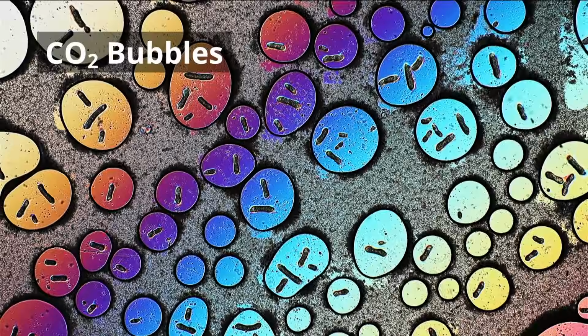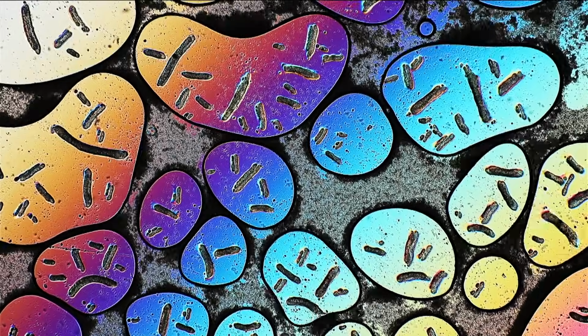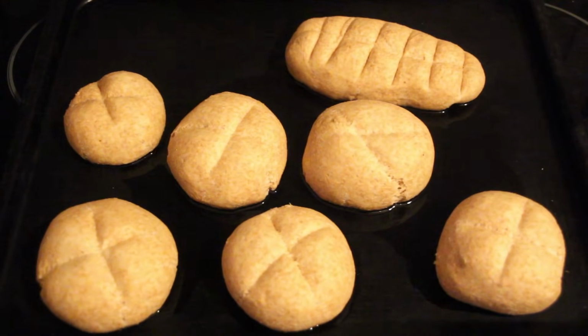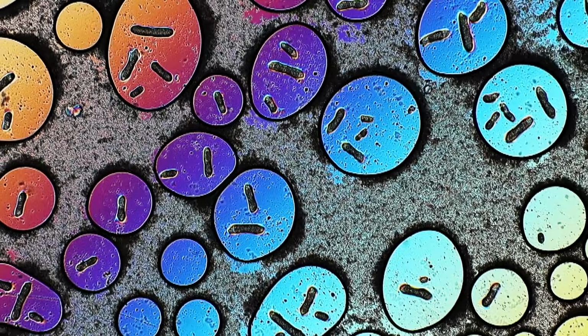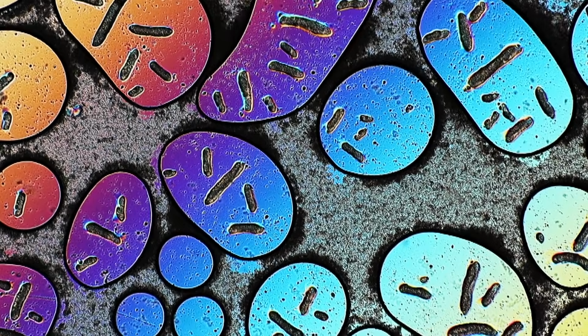You can actually watch the yeast produce carbon dioxide bubbles under the microscope. First you see many small bubbles forming, but over time these bubbles grow larger and some of them start to fuse together. The tiny dots you see between and around the bubbles, these are yeast cells themselves doing the work.